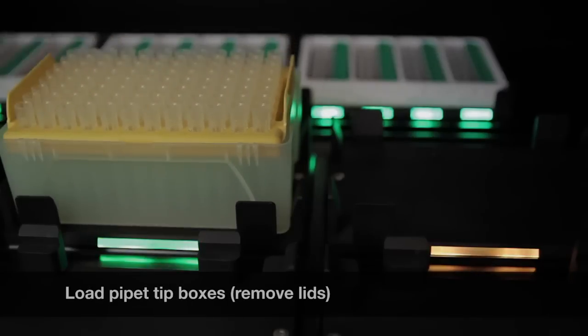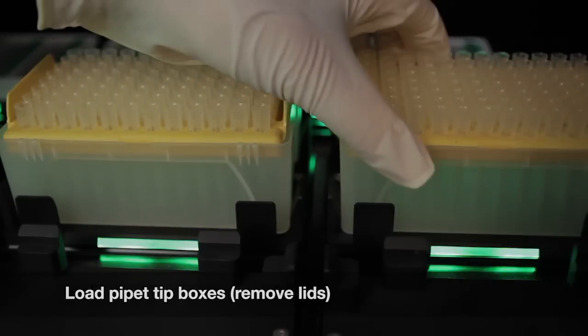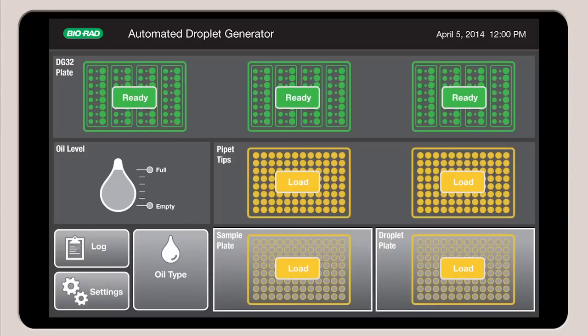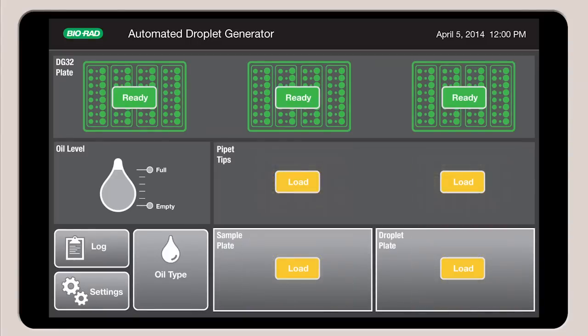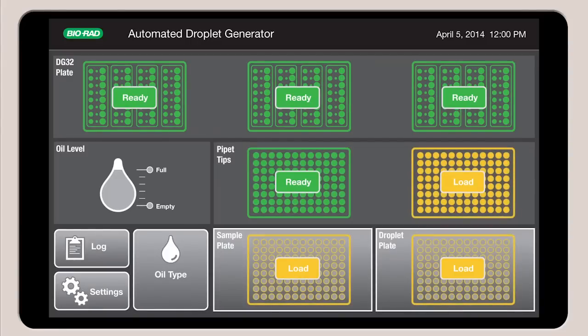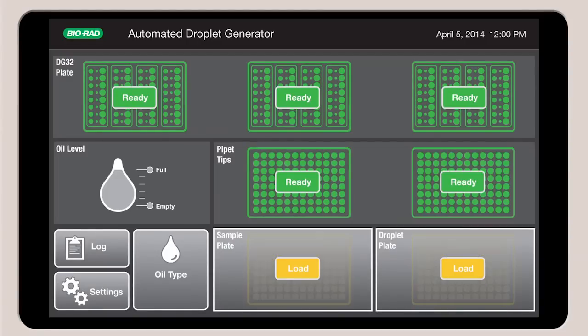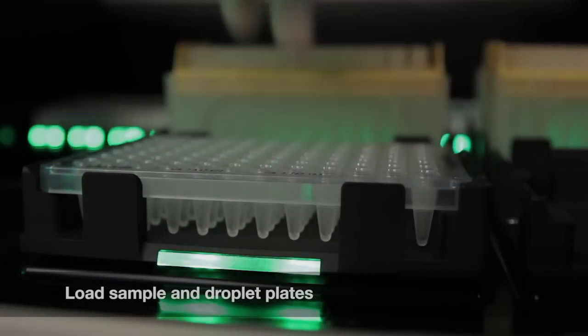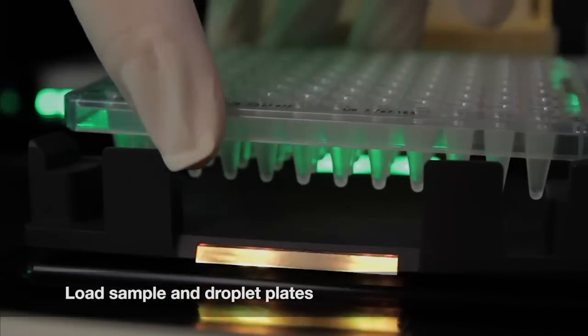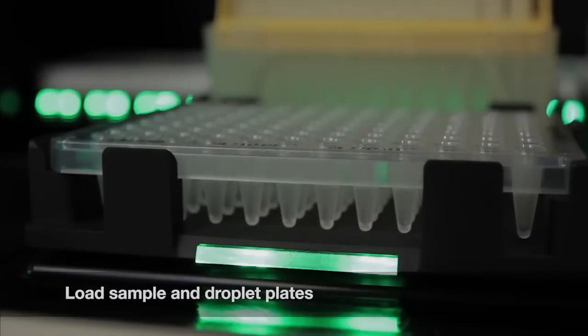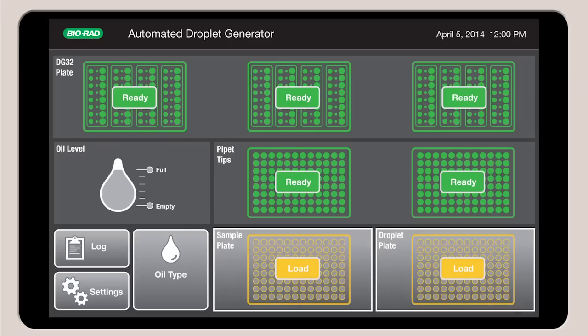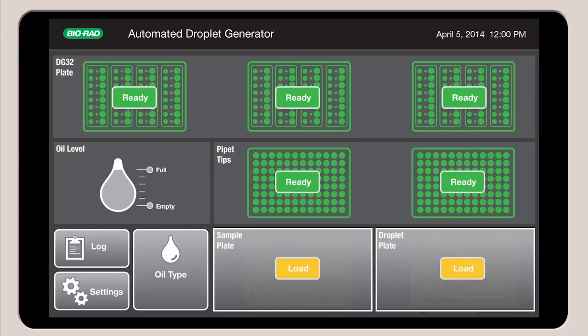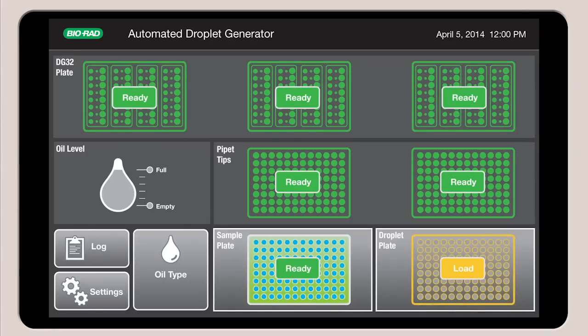Load the pipette tip boxes. Then load the sample plate containing the PCR reaction mix and place a new PCR plate into the droplet plate holder.